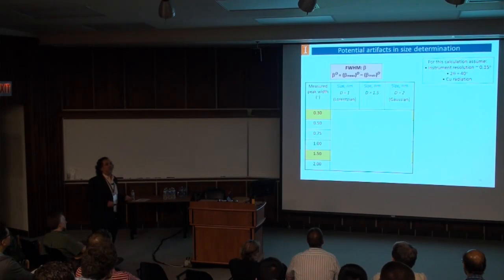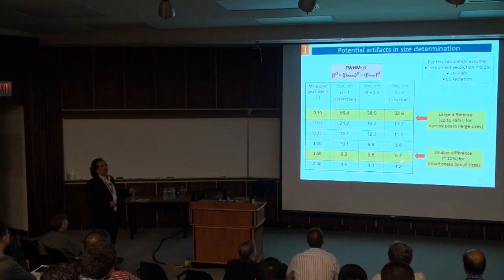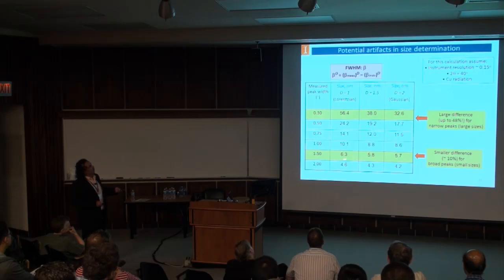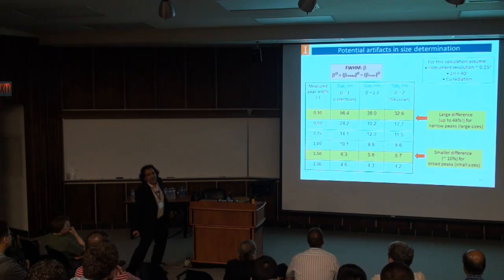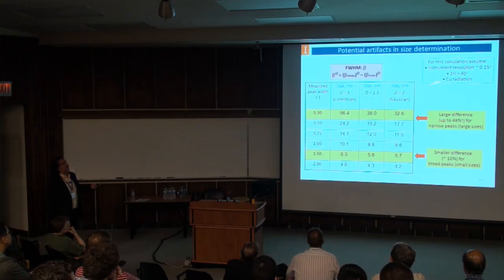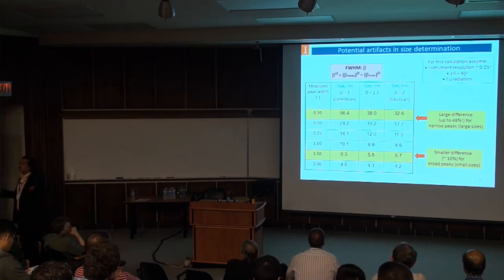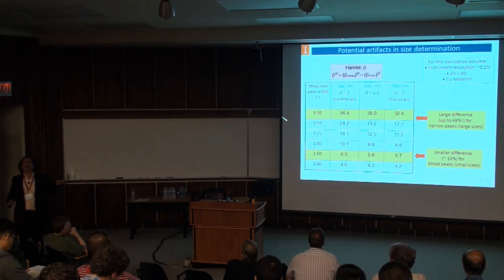Then let's say that one student in the same group takes the data and calculates using a Lorentzian function. The other one does a Gaussian. Look what is happening here. If the peak is very broad, the instrument correction doesn't matter too much because the peak is big. It's like you have an elephant and a little ant there, it doesn't care. Now, imagine you have something that's already small and you have a significant part to correct. So it's very important. If they use different methods, you can get a 50% error difference between the data.